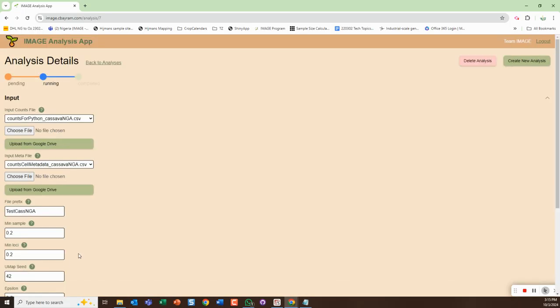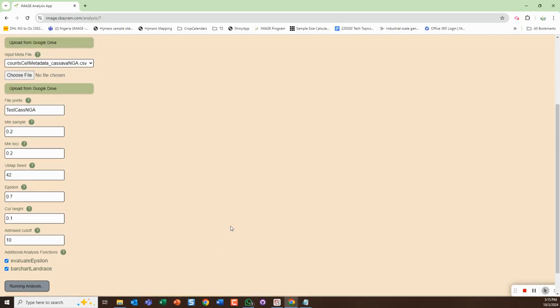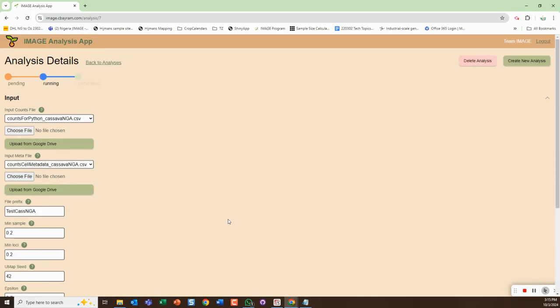Now I'm going to run analysis. It kicks off that analysis and it tells you that it's running up here. If you scroll down you also see that it's running analysis there. Depending on that - well it's completed, so it ran pretty quickly.